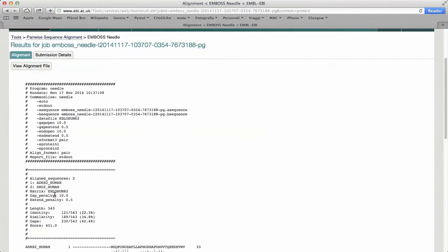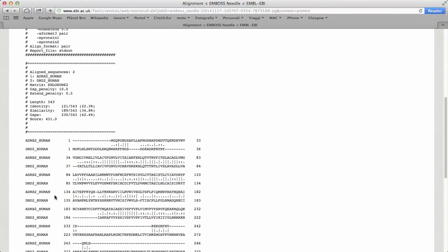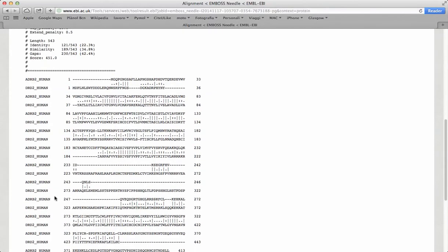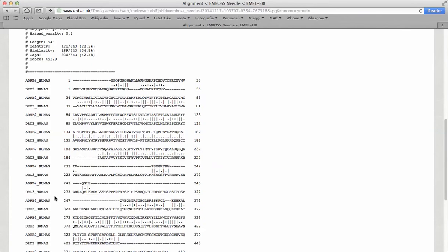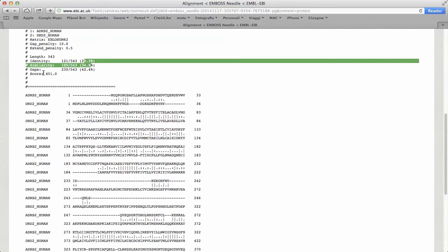These are the results. As we can see, when we compare two distantly related sequences, we can observe that values for identity, similarity, and the score of the alignment is decreased.